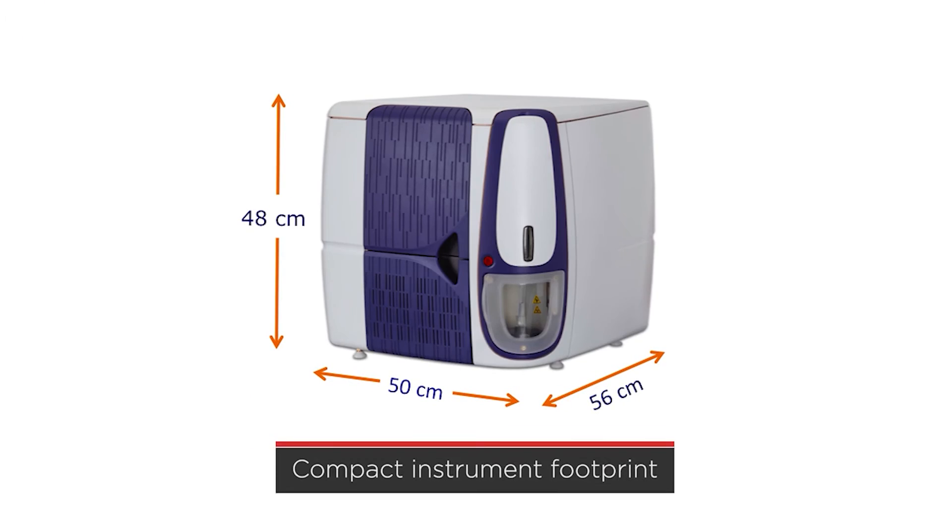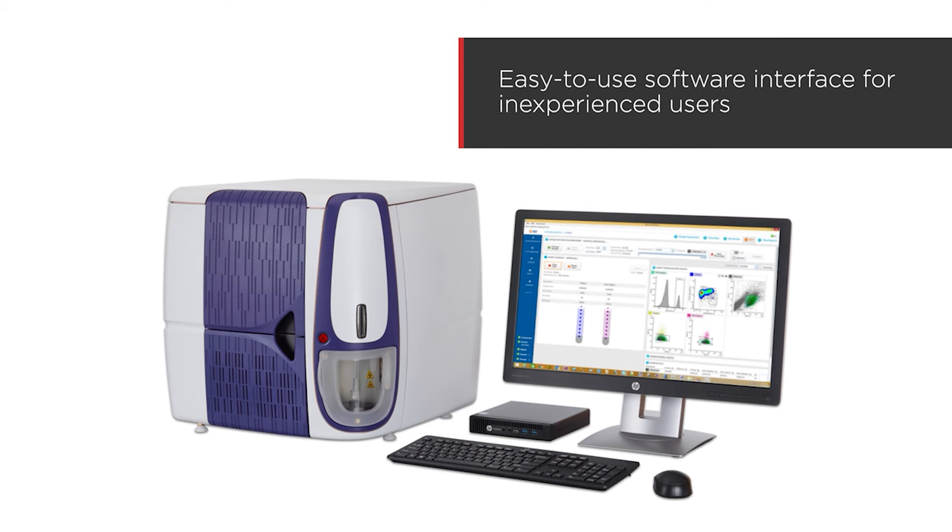Here's what Mark Gilbert has to say about using the BDFAX Melody cell sorter. The footprint of the machine is nice and compact, and it's quite easy to use for people who don't have a lot of FACS experience.